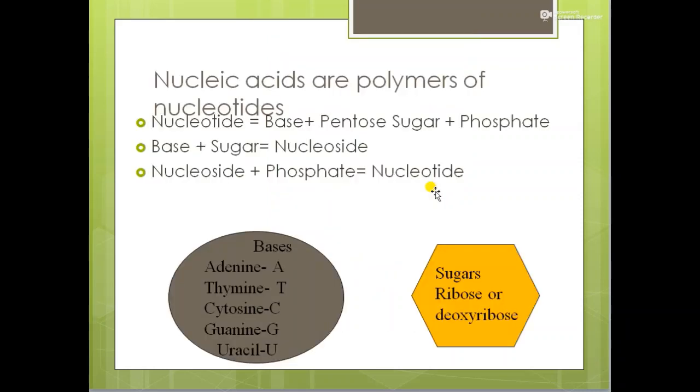Now, what is the principle of this staining technique? That's what we need to explore next. But before going to the principle of how Feulgen stain enables you to see DNA, I need to just say the basics of the structure of DNA. As we all know, DNA consists of deoxyribonucleotides, and they mainly consist of a base, a sugar, as well as a phosphate. And the base can be a purine or a pyrimidine.